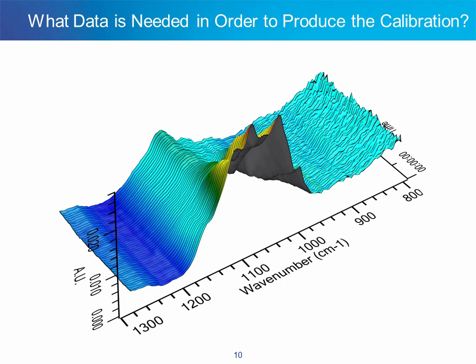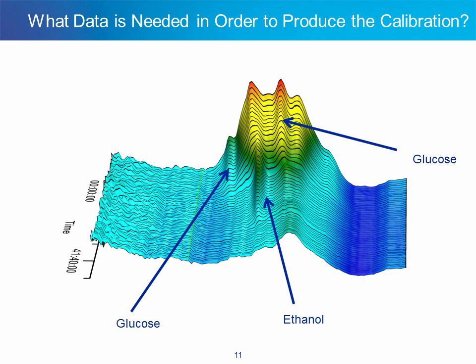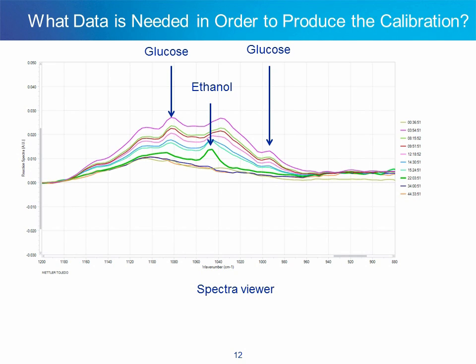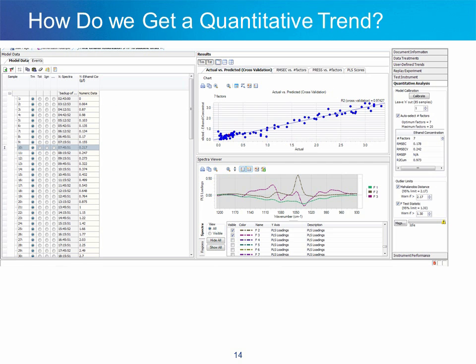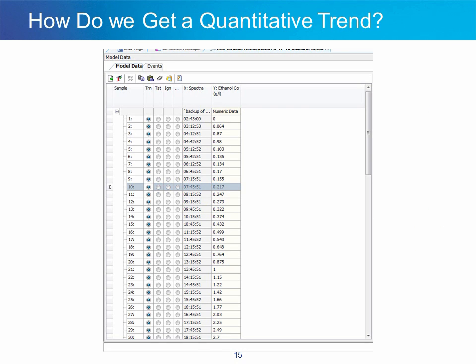Let's take a closer look at the surface plot. This plot shows the fermentation with decreasing glucose peaks and at first increasing and then finally decreasing ethanol peaks. Now we see spectra from the same process in a two-dimensional view. In the present case, we were able to create a real-time quantitative trend by taking appropriate infrared spectra paired with numbers from a referee technique. During the first 40 hours of the fermentation, approximately 800 infrared spectra were collected. For about 80 of these we had numbers from our referee technique, so about 10% of the data was used for calibration and the remaining 90% is used as test data.